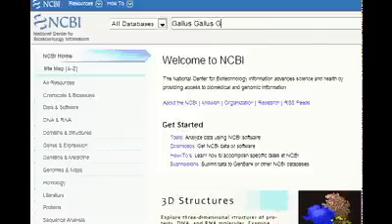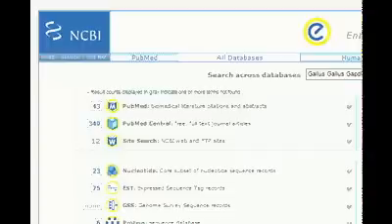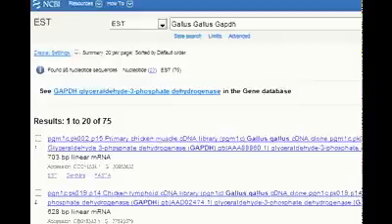You search for an area where you think there could be a possibility of a SNP site. We're searching in an area where we know that a gene actually starts, the start site of an expressed gene, which basically means that is the part where the mRNA, the messenger RNA, gets read and turned into a protein. So that's the actual beginning of the gene. You would find that area of the genome through the NCBI website, and then you would design primers.